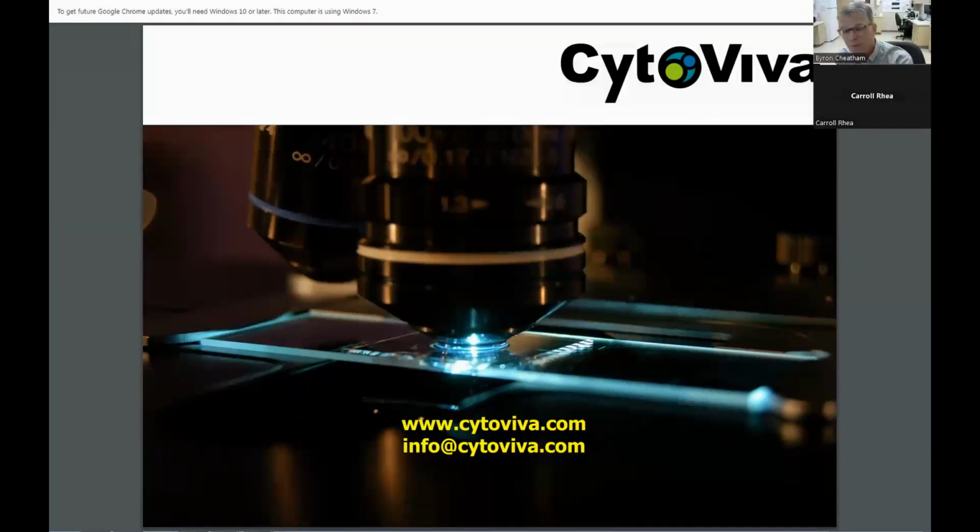And that can be supervised algorithms, unsupervised algorithms, principal component analysis. Again, this is very rich data sets, and it's being utilized for a wide range of applications. For example, there's some pathology applications where some very specific algorithms are being created to do some very unique things in pathology. And there's some other applications in material science where that would apply as well.